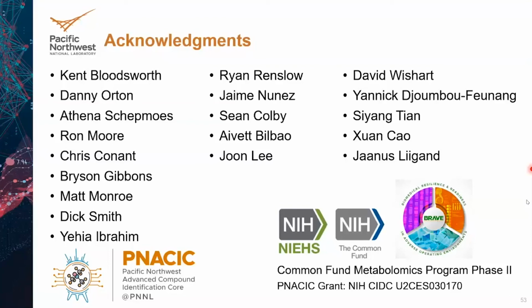We've got some molecules that Peter Dorrestein shared with us, which are microbial secondary metabolites. We've got molecules from the EPA, which are exposure compounds, man-made. They have very different chemistries, halogens incorporated and so forth. And so hopefully, if we analyze a sufficient representation of chemistry and we see good agreement between the predictive tools, then we'll be much more confident in using them in our routine metabolomics analyses.